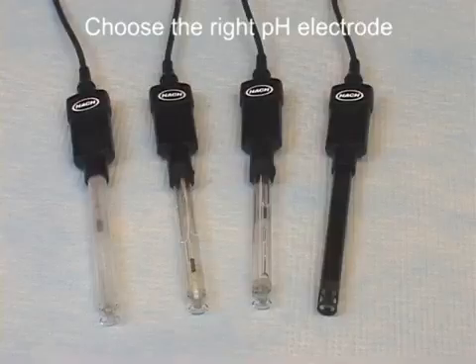I'd like to spend a few moments with you covering some of the basics of pH measurement. pH is the single most frequently measured parameter, so it's important to follow a few simple guidelines to ensure you're getting the most out of your pH system. Over the course of this video, we'll cover the basics of calibration, measurement, and electrode maintenance.